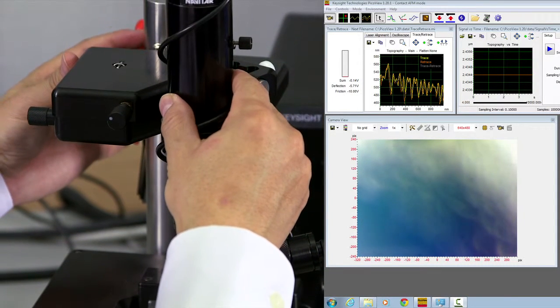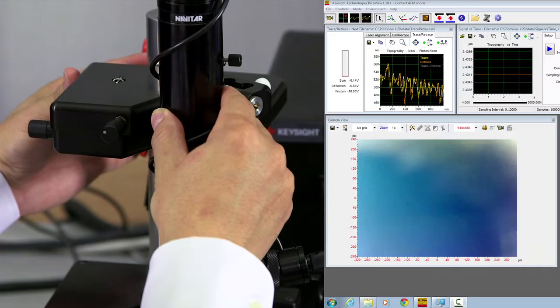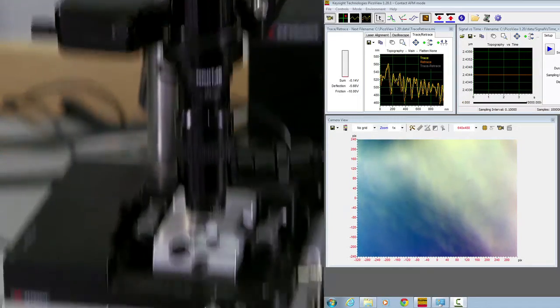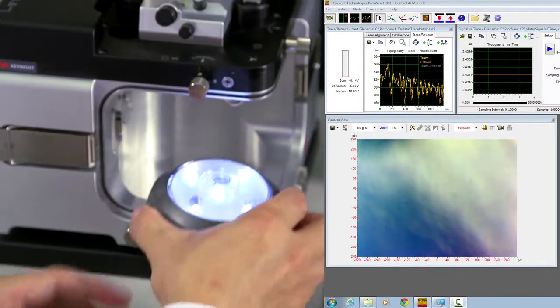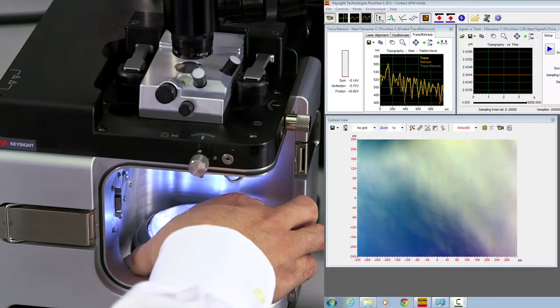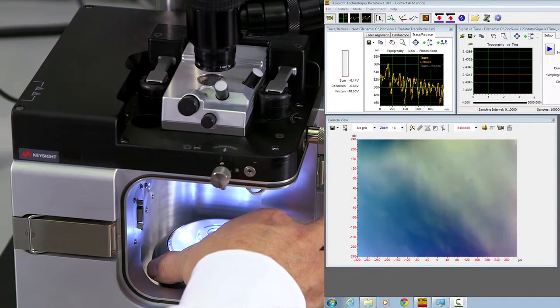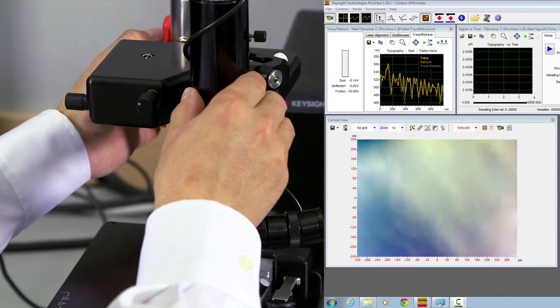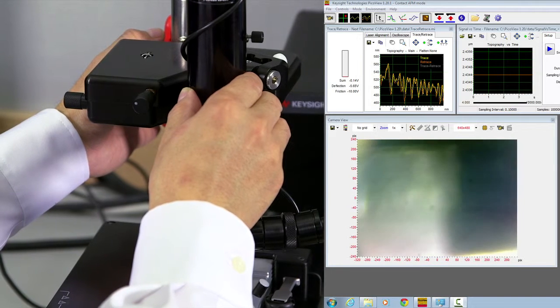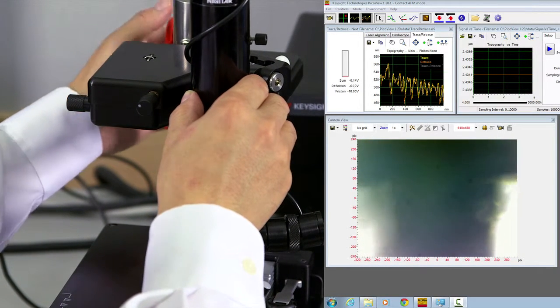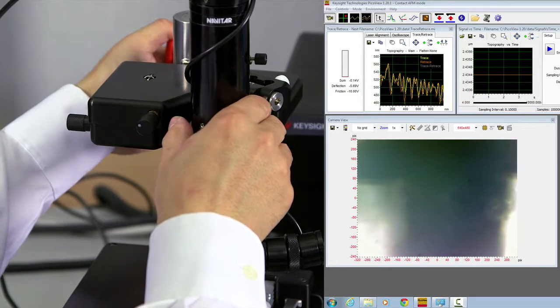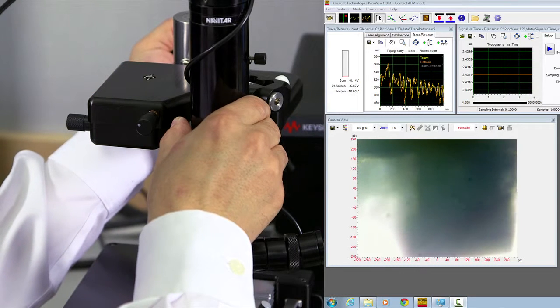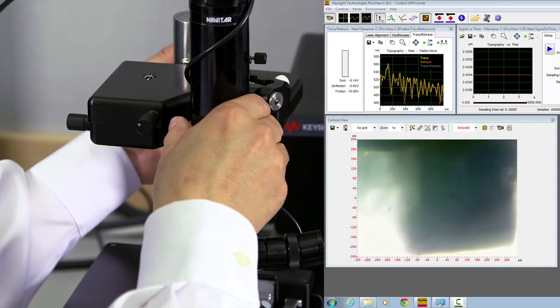You can rotate the optical microscope assembly itself. Make sure it can be rotatable. Then you turn on the LED light and put in the environment chamber to allow some transmission light through the scanner itself. Rotate until you can see something, and then turn the Allen key to tighten the set screw until the optical microscope assembly cannot be rotated anymore.